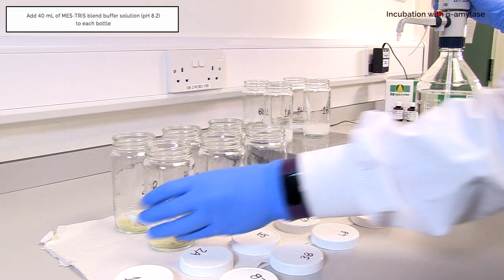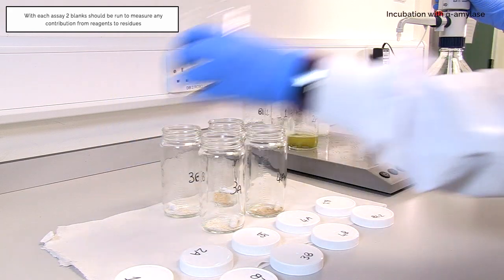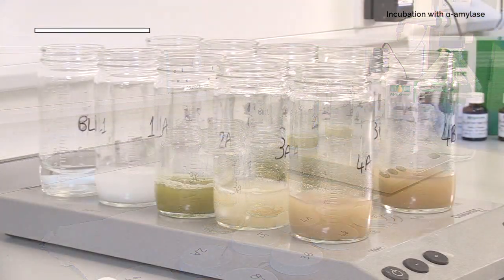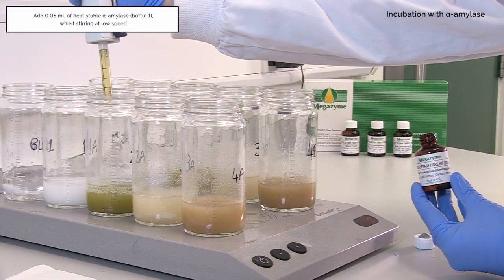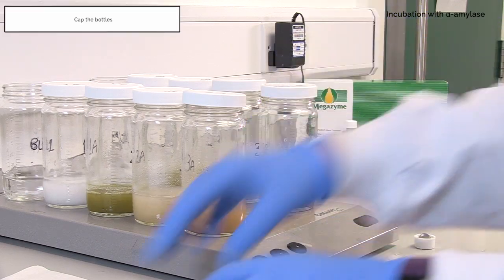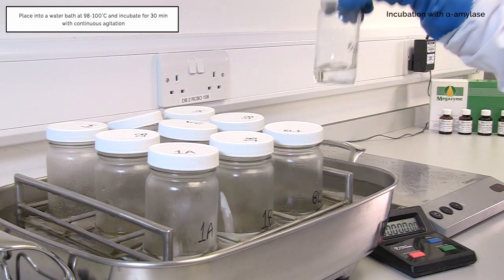Add 40ml of MES-TRIS blend buffer solution pH 8.2 to each bottle. With each assay, two blanks should be run along with the samples to measure any contribution from reagents to residues, and should be included in all processes. To prevent lump formation, stir on a magnetic stirrer until sample is completely dispersed in solution. Add 50µl of heat-stable alpha-amylase while stirring at low speed. Cap the bottles and place into a water bath at 98 to 100 degrees Celsius and incubate for 30 minutes with continuous agitation.